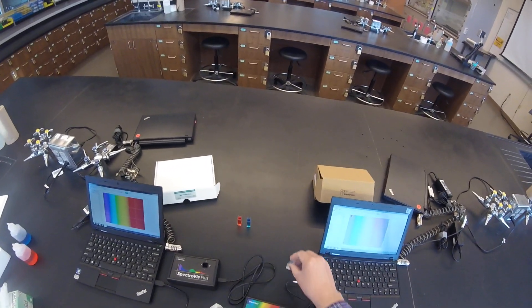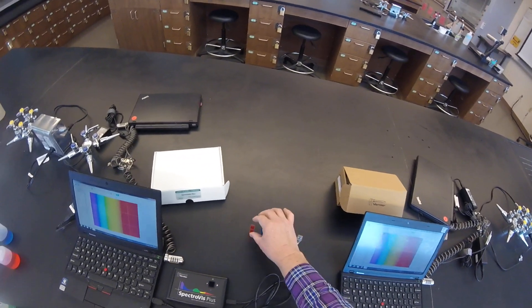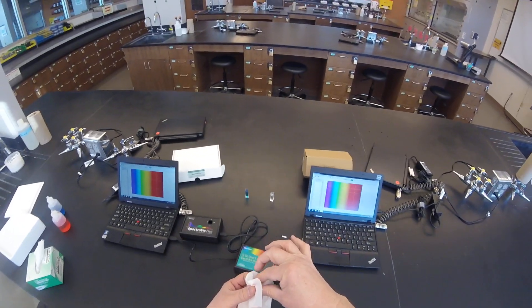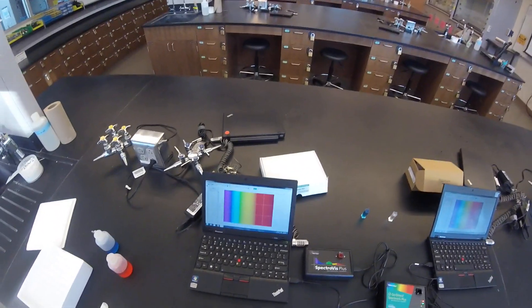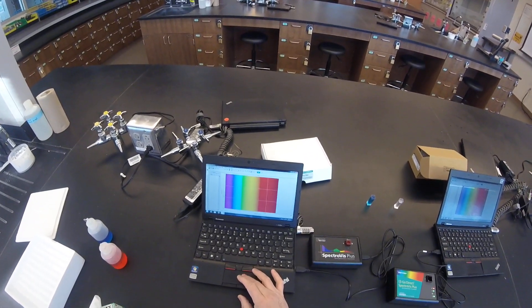The instruments, both of them, are now ready to use. I'm going to measure, let's take and measure the red over in the SpectraVis Plus. I'm going to click here. We're going to click on the green Collect button.